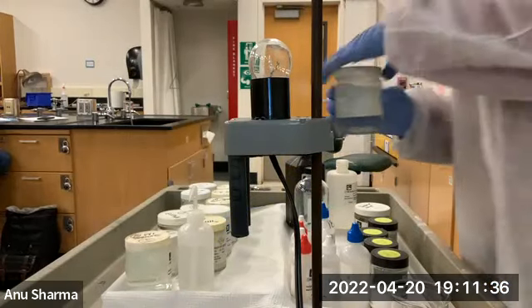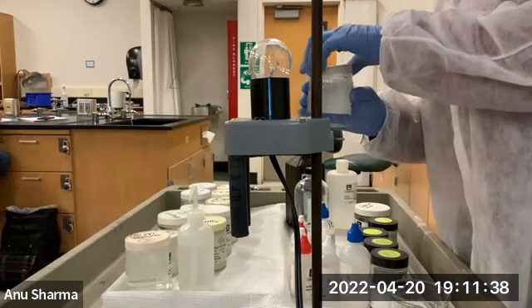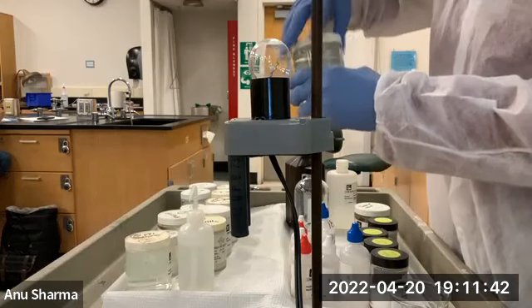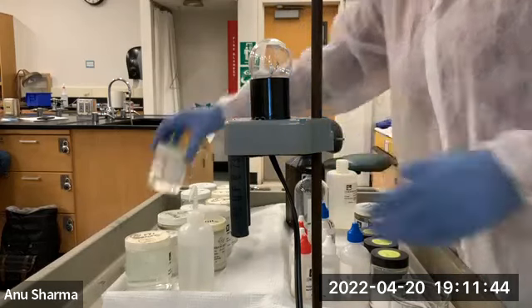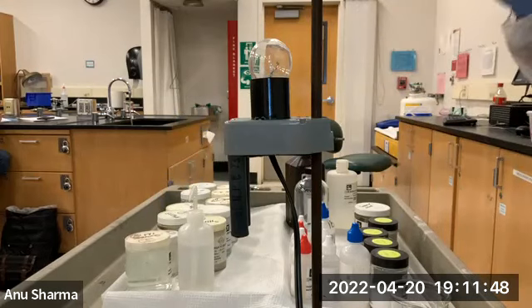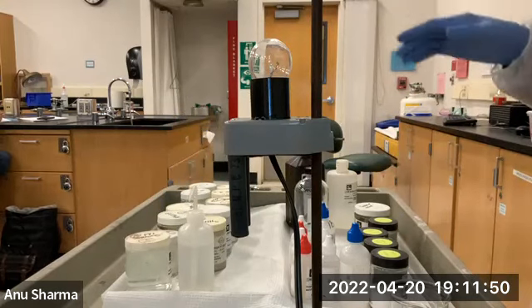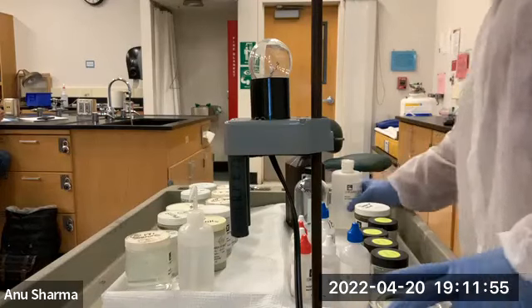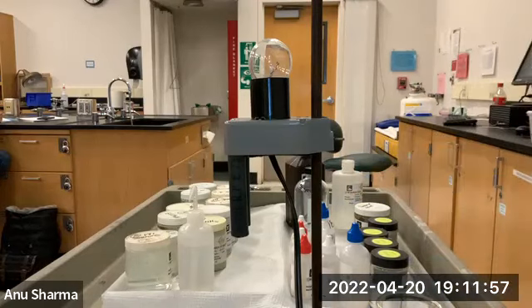Now, number 5. Number 5 is ethanol. It is ETOH. Now, what do you think? ETOH means C2H5OH: 2 carbons, 5 hydrogens, and then an OH group. So what do you think of this one? Make a prediction. ETOH, will it ionize or not? Based on what I told you.